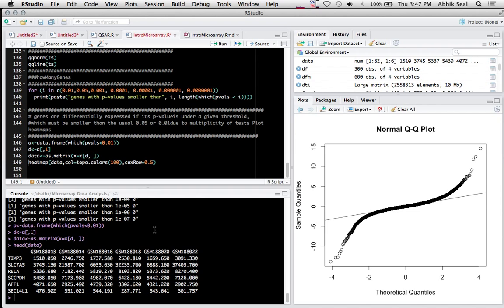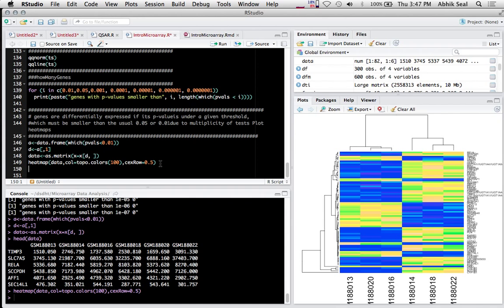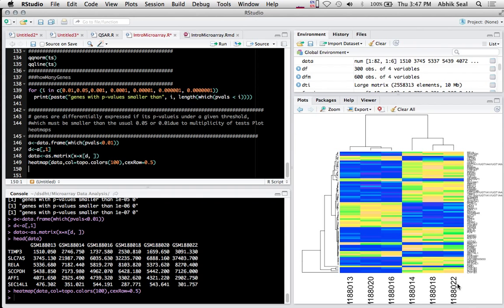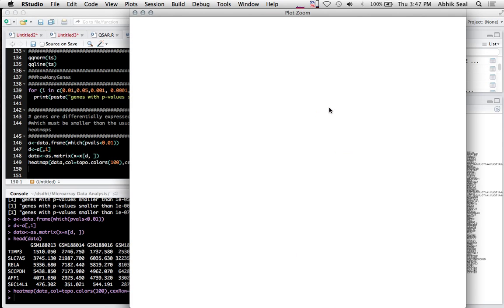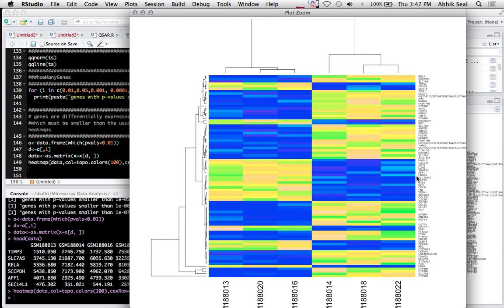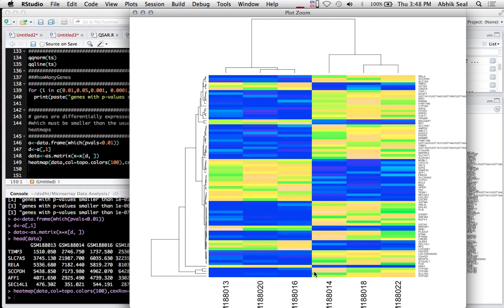Now I only use those indices which have p-value less than 0.01 - there are 82. I create a data frame of that heatmap data which gives you the samples as well as the significant genes. Then you can plot the heatmap to see how the genes got expressed.